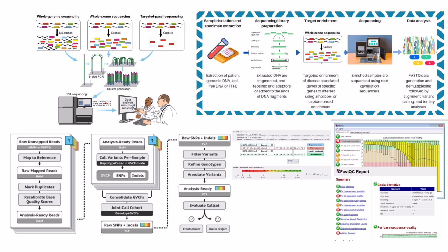Which leads to a really interesting thought to end on. This pipeline, as we've discussed, is incredibly sophisticated. It pulls from vast databases, applies complex algorithms and filters. It does so much work. But the output, even after all that, is still often a list of variants, including perhaps some variants of uncertain significance or maybe even novel variants never seen before. That definitely happens. So, given the sheer volume of information processed and the potential ambiguities remaining in that final output, what new challenges do you think emerge right there at the interpretation stage? What's the indispensable role that human expertise, the clinical geneticist, the counselor, considering the actual patient, plays after the script has done all its automated work? What happens next?